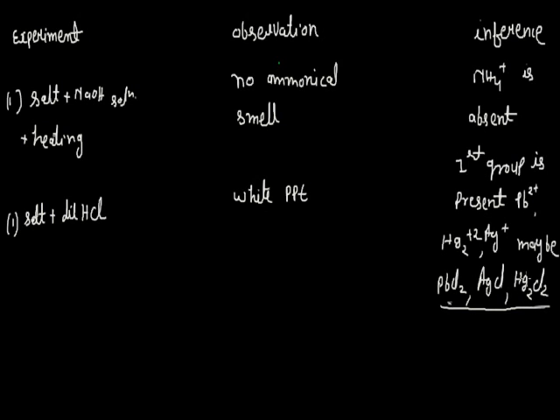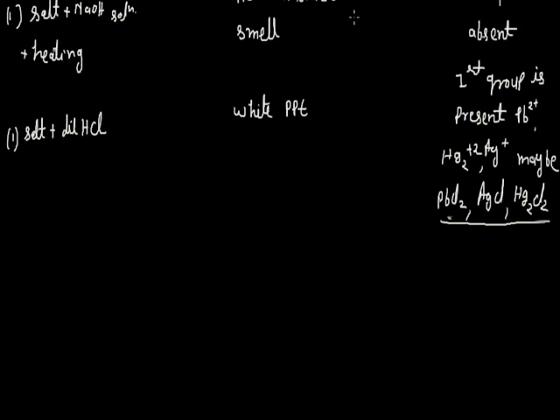For confirming these three radicals separately, we use confirmation tests. The first confirmation is whether the white PPT dissolves in hot water.